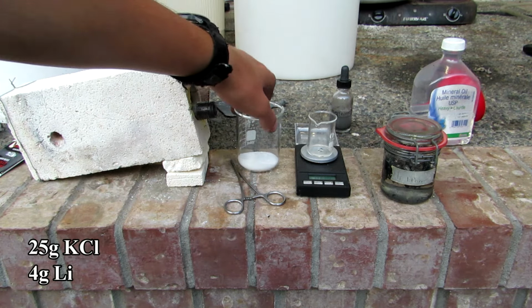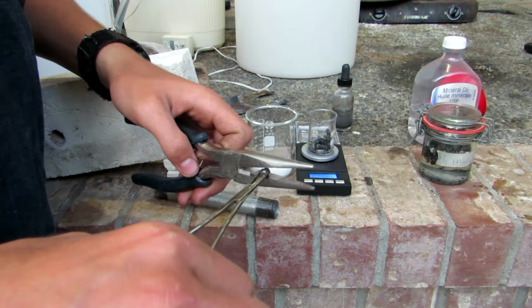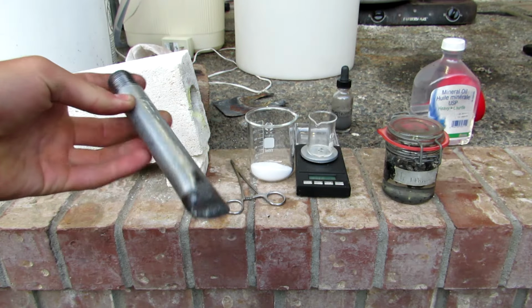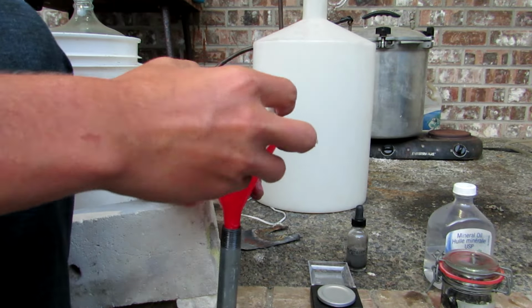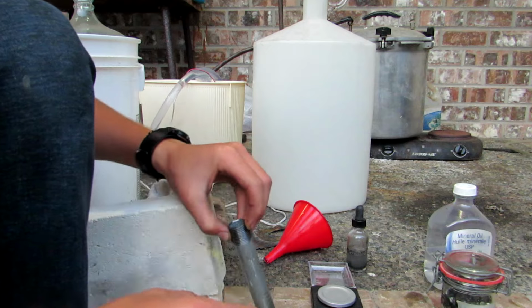To begin, 25 grams of potassium chloride and 4 grams of lithium metal were weighed out. The lithium chunks were squished between some pliers to increase the surface area, and then it was loaded into a steel tube, which had one end welded shut. During the loading, the potassium chloride and lithium pieces were added alternately so that everything could react easier.